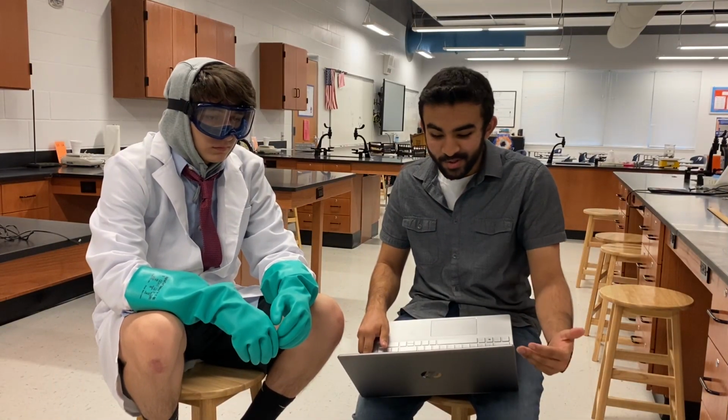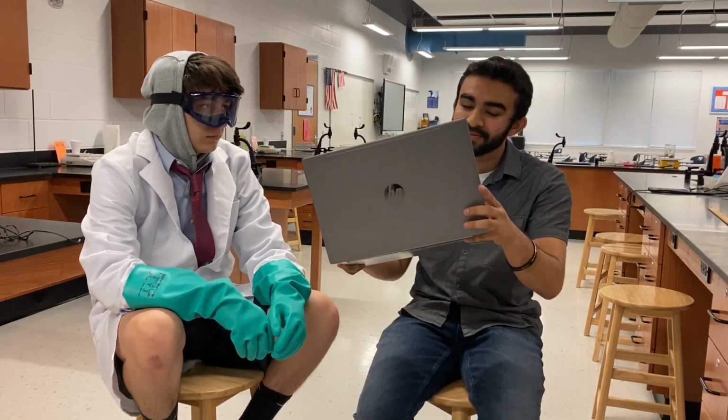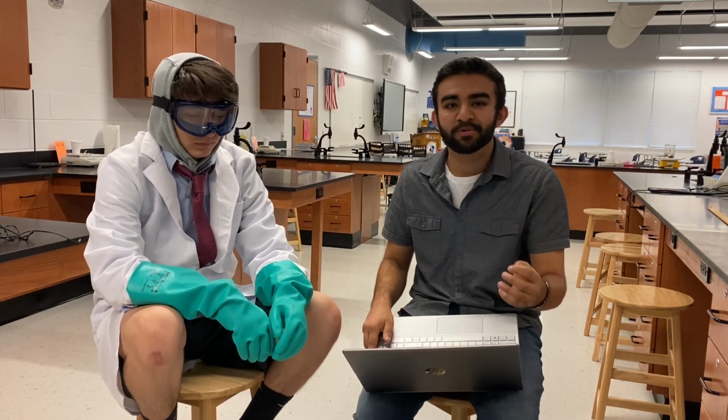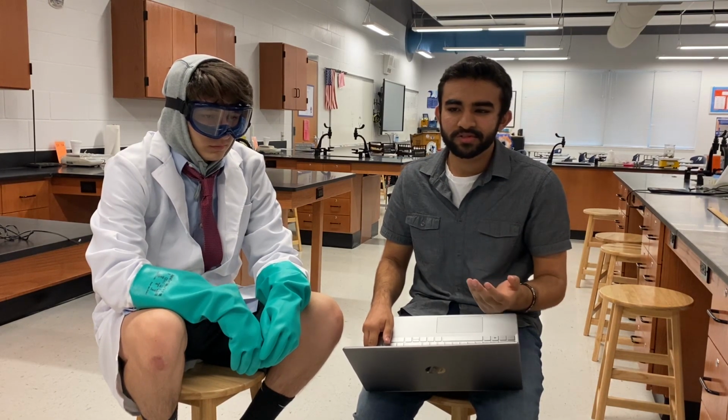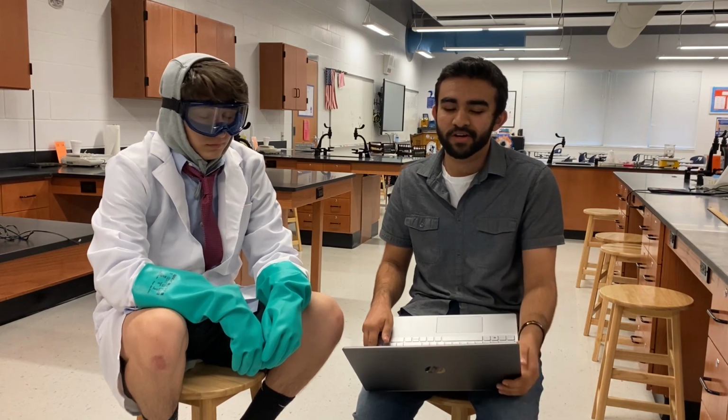Alright guys, so we're back. What I got here is some really important lab rules that you would want to follow in the laboratory. In most schools, you're probably going to have to sign a safety contract, so it would be important to know the main ones that you would want to follow.